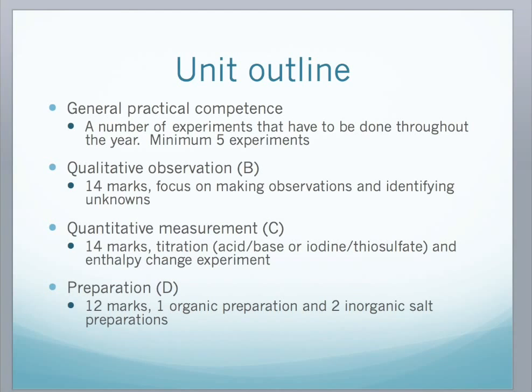And the final task, D, which is preparation, is marked out of 12 marks and will involve the preparation usually either of a simple or a double salt. So let's look at all of these in detail. Let's start off with the qualitative observation, which is B.